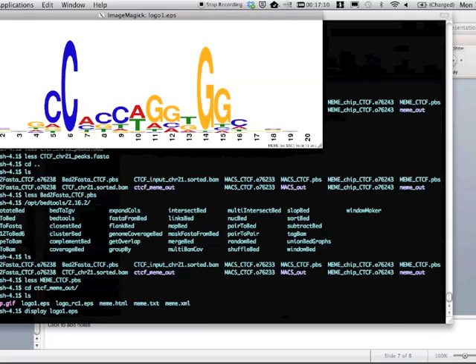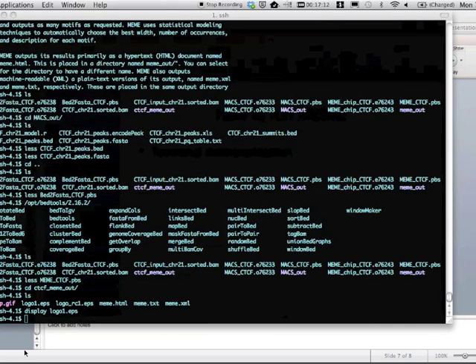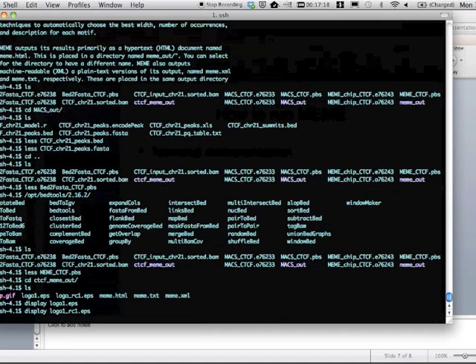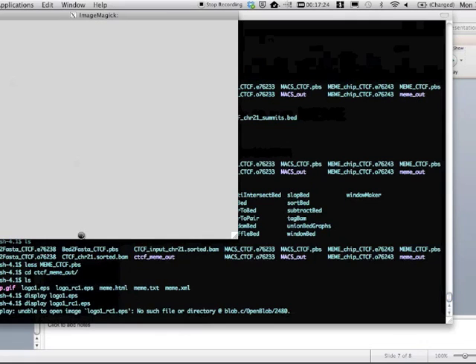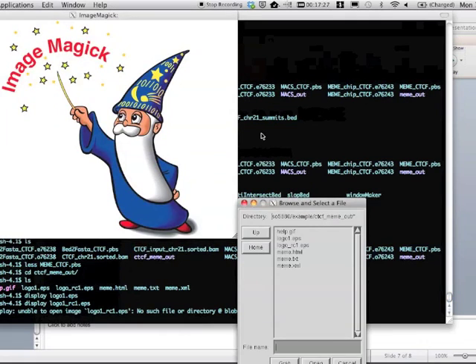But don't be discouraged if the first time you look at this, you don't recover it, because it could be that it just found the reverse complement. It also gives you the reverse complement of the logo. So it depends just on how websites listed it or how other people have found the logo.